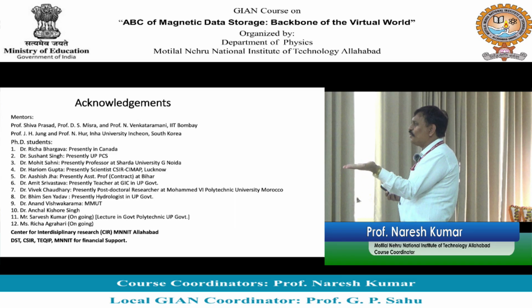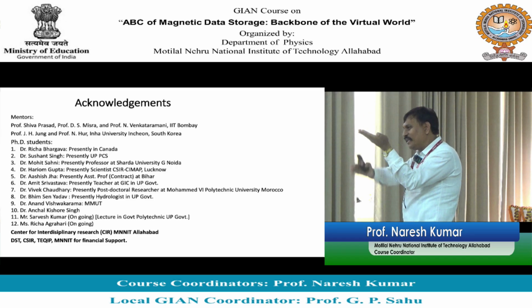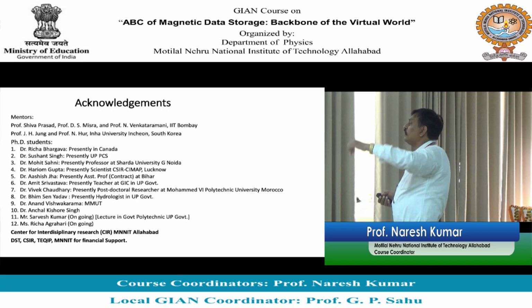एक्सरे में सैंपल हॉरिजॉन्टल है, एक्सरे में ऐसे है और रिफ्लेक्शन होता है. टीएम में इलेक्ट्रॉन बीम gets transmitted. और very good thing about XRD के सैंपल remains same, इसमें कोई नुकसान नहीं होता. But in TEM the sample goes, नहीं, because you have to prepare the sample so that the electron beam can transmit through. So thickness is very, मान लीजिए if you are working with thin film, either you have to peel it off or you have to etch it so that electron beam can transmit through.